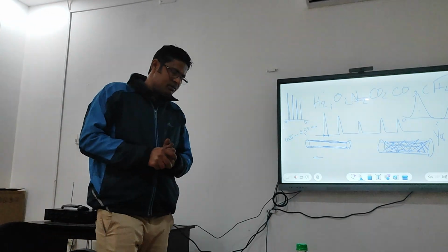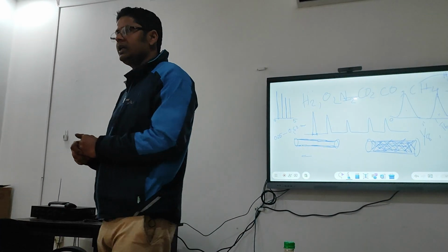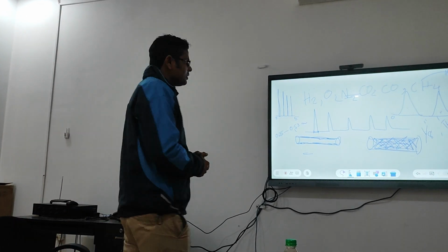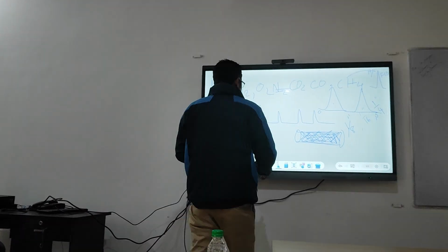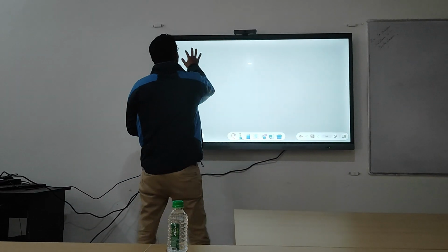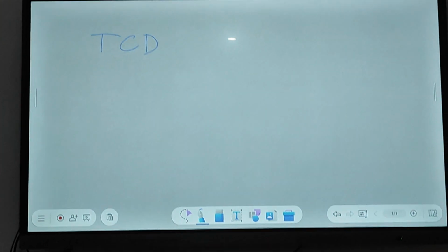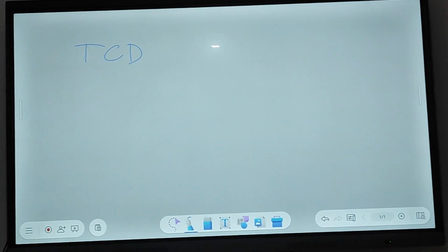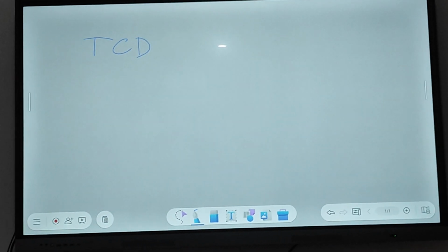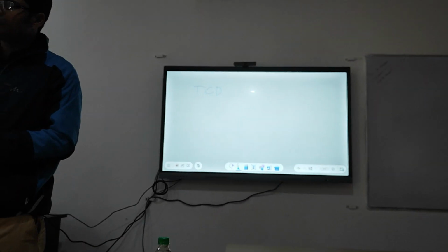Now you will learn about TCD, thermal conductivity detector. It's a universal detector. It can detect anything, but sensitivity is poor. While FID detects only hydrocarbon, TCD can detect anything.